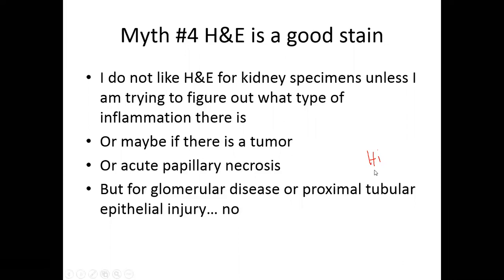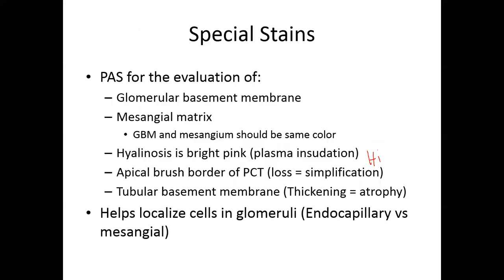And this little hi here was Mary and I practicing annotating on slides. So apparently I can start to draw on my PowerPoint slides. Okay, so what special stains should we use? And the first one is the periodic acid Schiff. That's probably the go-to one that we learned about when we were doing the WSAVA study. It was the first, oh my gosh, the hi stays there. I got to get rid of that hi. Can I get rid of it? Clear all drawing. Yay, okay, learned.